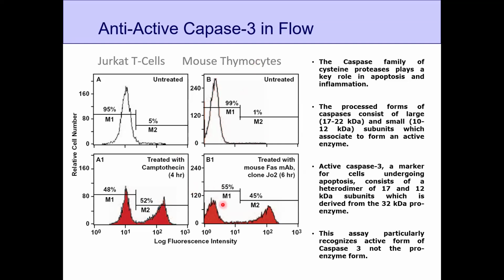In untreated cells there is no caspase protein, but after the treatment the caspase protein starts showing up, which means these cells are going toward apoptosis.